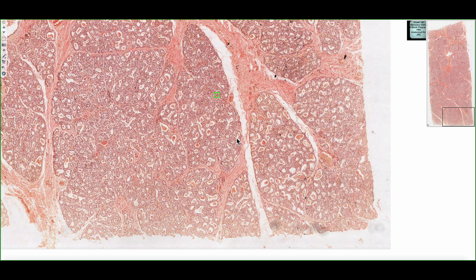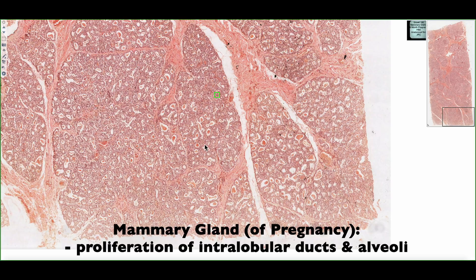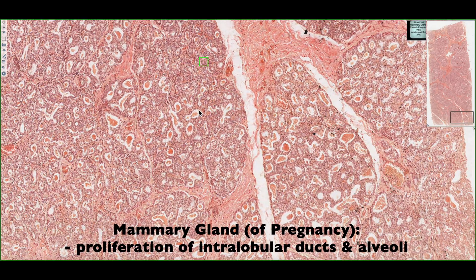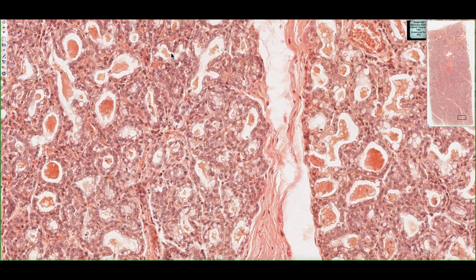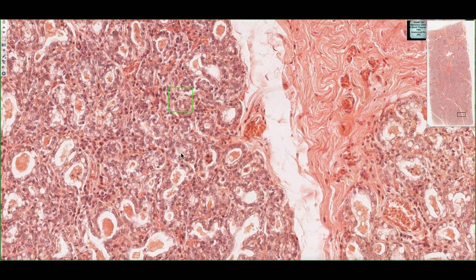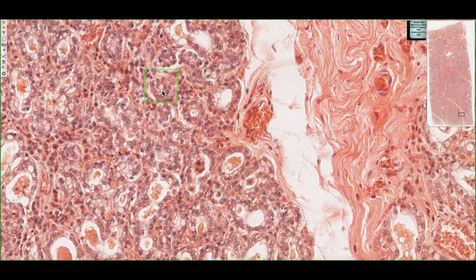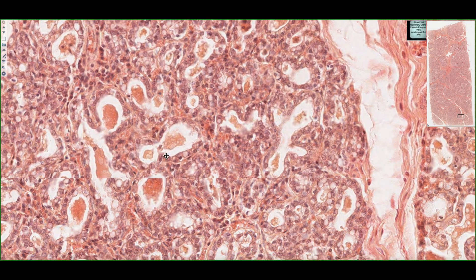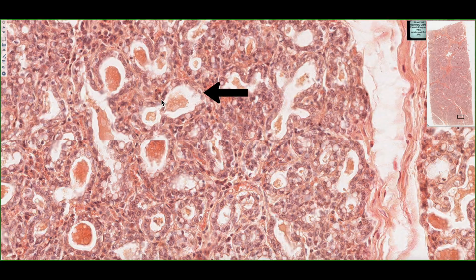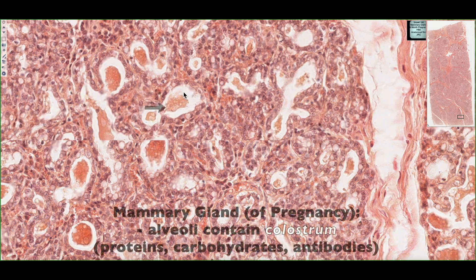In this tissue section, we're looking at a mammary gland at six months of pregnancy. We no longer have a predominance of dense, irregular connective tissue. We actually have a predominance of alveoli and our duct system. Looking at the section, we can see a structure with a nice layer of simple cuboidal epithelium and a lumen — this is our intralobular duct. Adjacent to it, we can see all these white spaces lined with cells, which are alveoli.